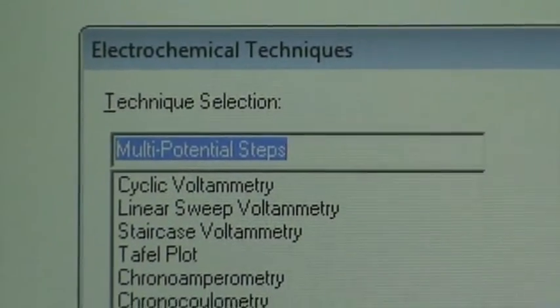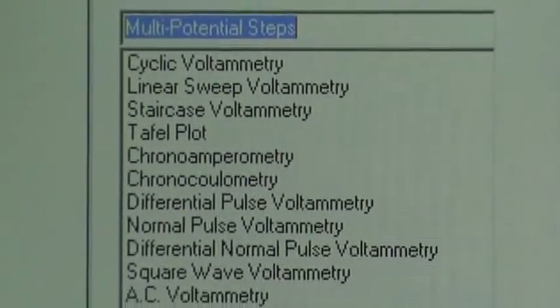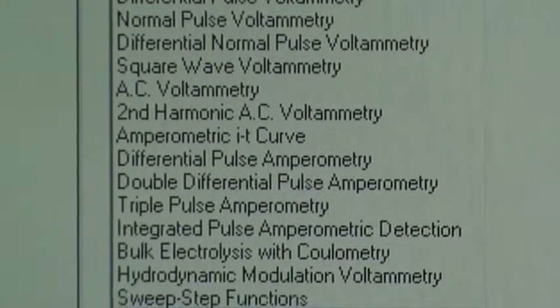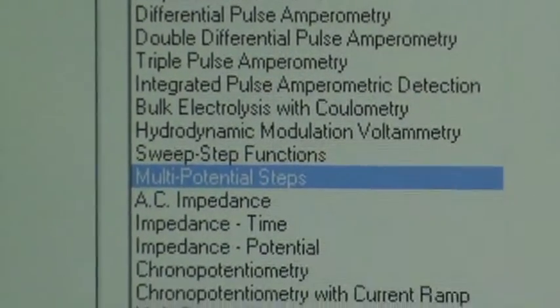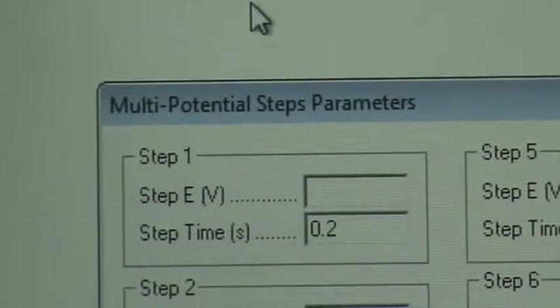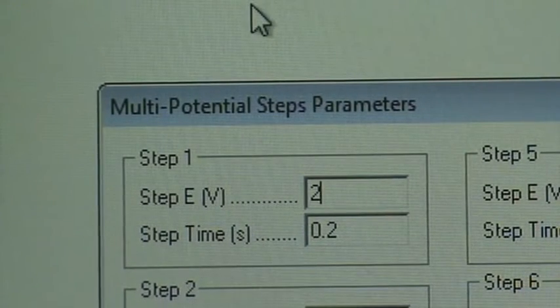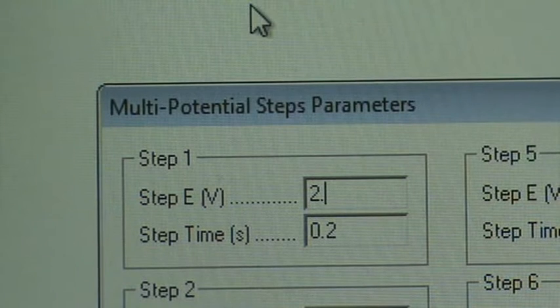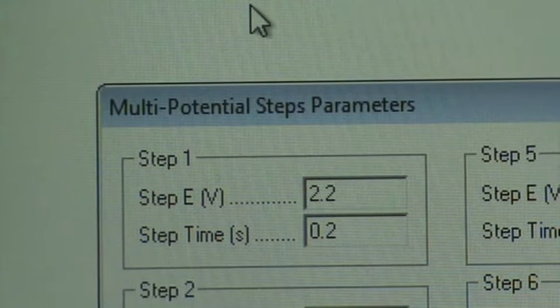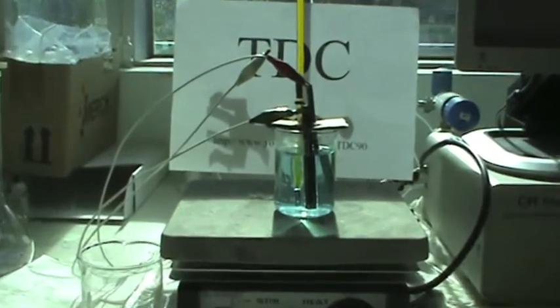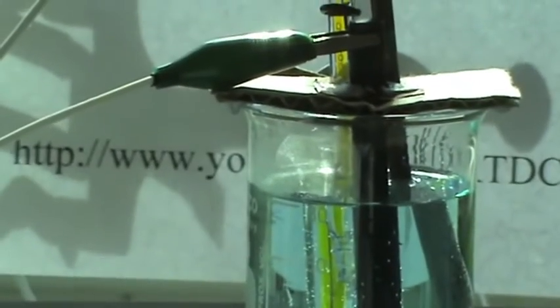To start the experiment, we need to select the correct electrochemical technique on the computer program, which is the multi-potential steps technique. In this technique, we can hold a particular potential for a period of time. For our case, a potential of 2.2 volts and 10,000 seconds, which is about 2.8 hours, is selected. Once the parameters are all set, press OK.